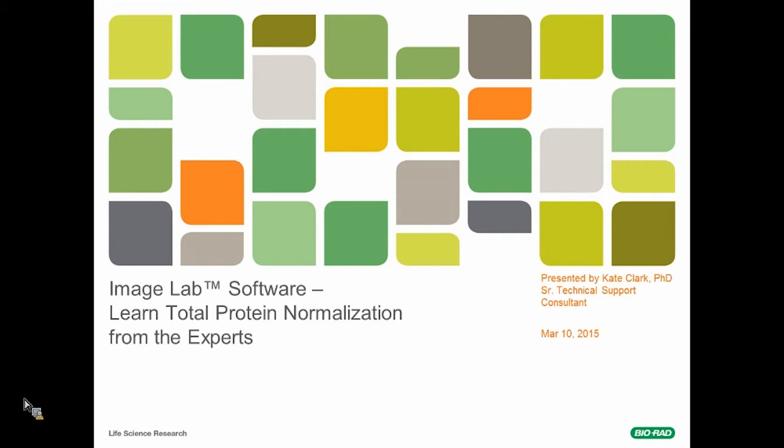Let me also introduce myself. My name is Kate Clark. I've been a member of the Bio-Rad technical support team for over 12 years. I'm excited to share some tips for using total protein normalization to more accurately quantitate chemiluminescent data. So let's begin.